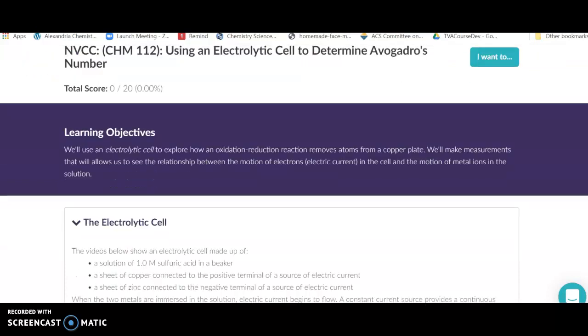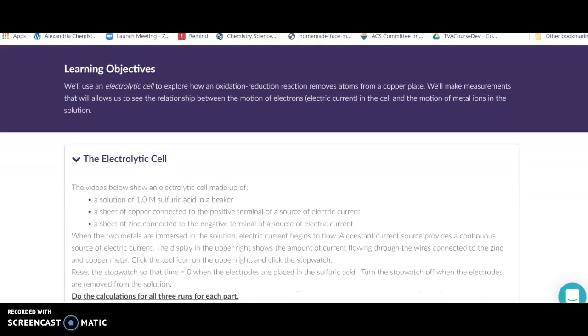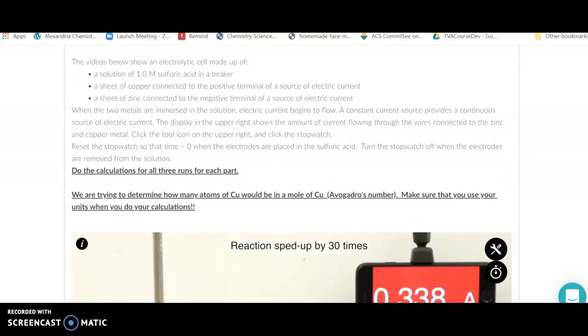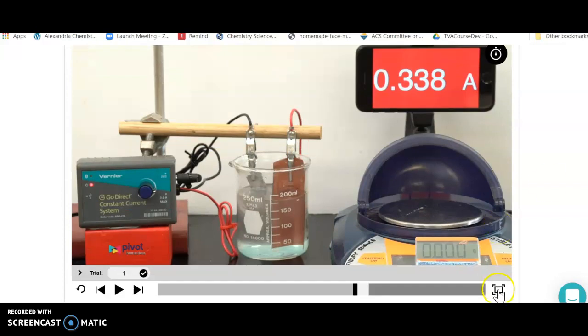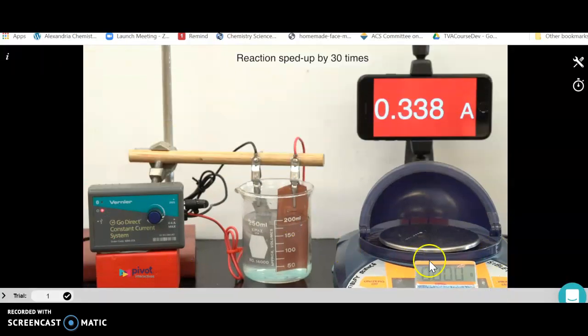To do this we're going to add some energy to this cell—that's what electrolytic means, as compared to galvanic which means we're going to get energy or work out of it. You're going to do this for all three trials, so here you're going to expand your video to fit the screen and start with trial one.